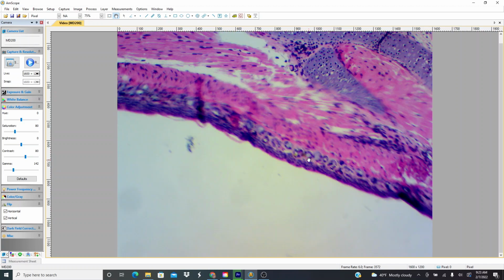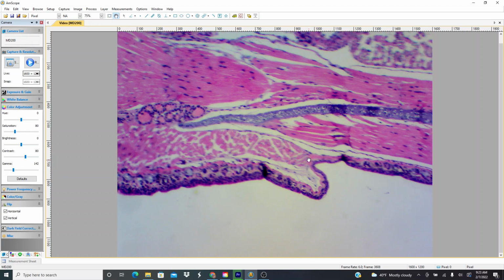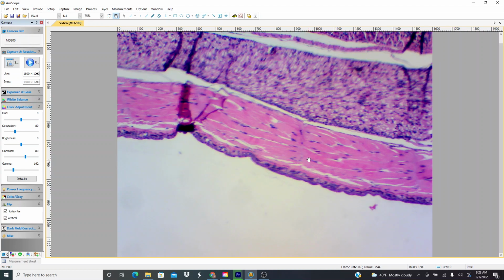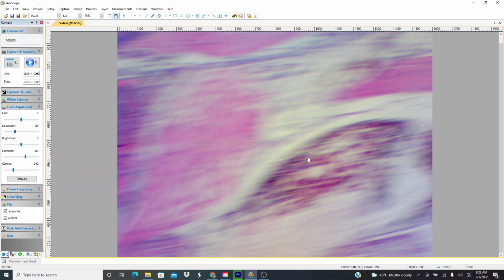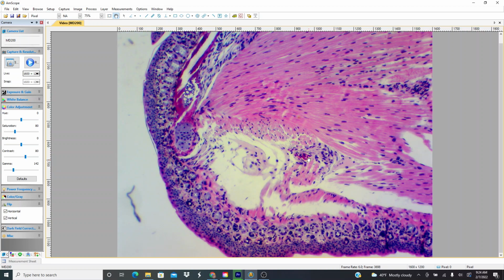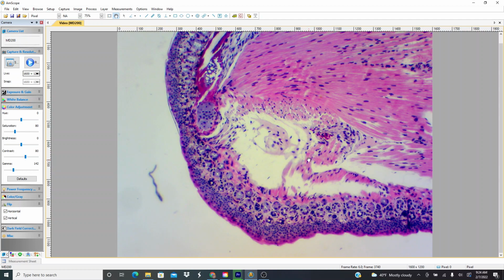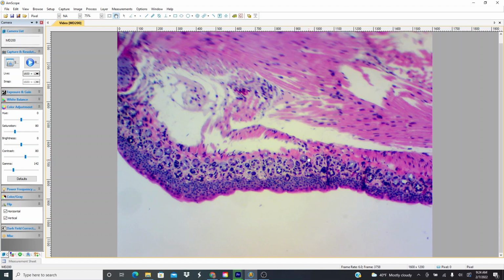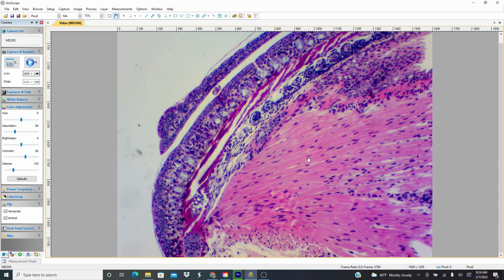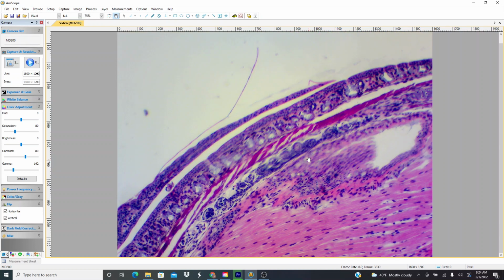And unfortunately, this camera microscope I'm using is just a little too powerful, so it's kind of hard to zoom out at low power. So that's one thing I might have to try to figure out how to fix. But I want to start over here, and this is a histopathology section of tissue. And the first thing I'm noticing is that this salamander doesn't have a squamous lining. Like the skin is lined by something very different. It's very fascinating. It's got all these tiny little glands that are underneath the surface.